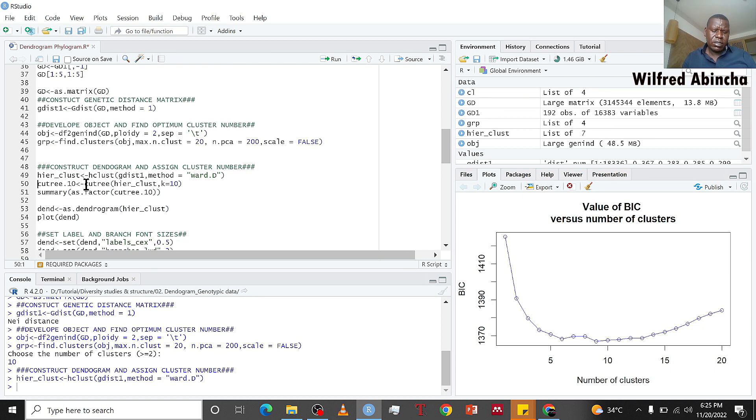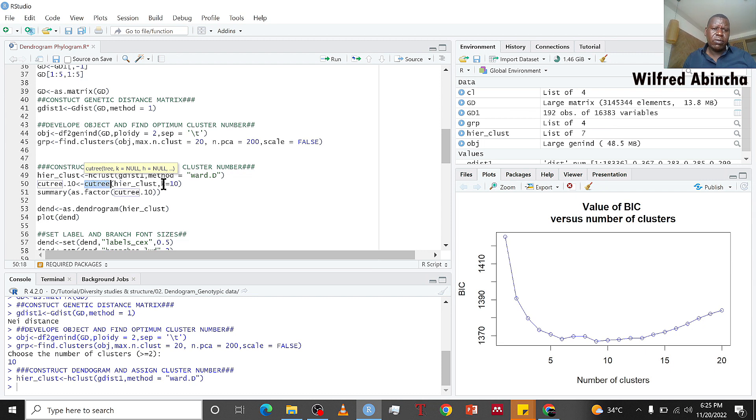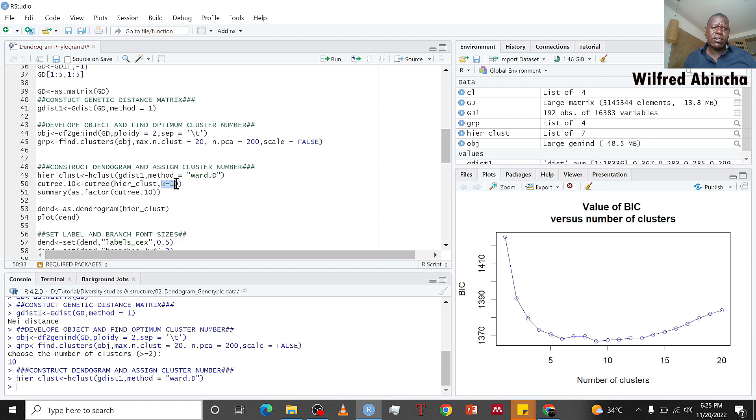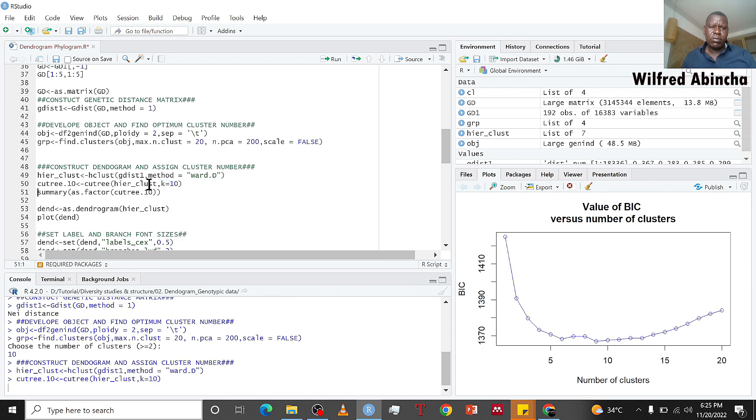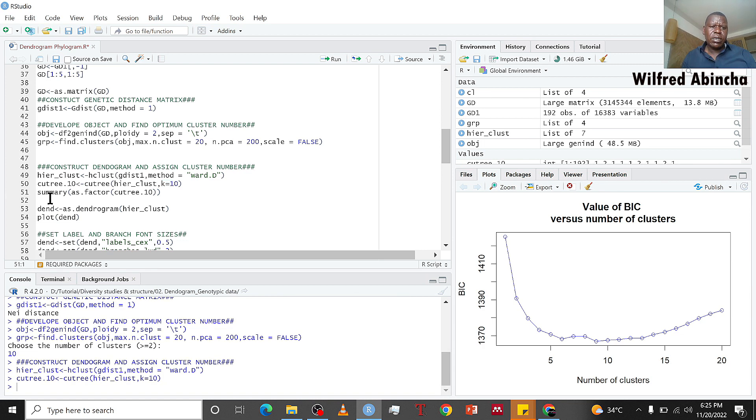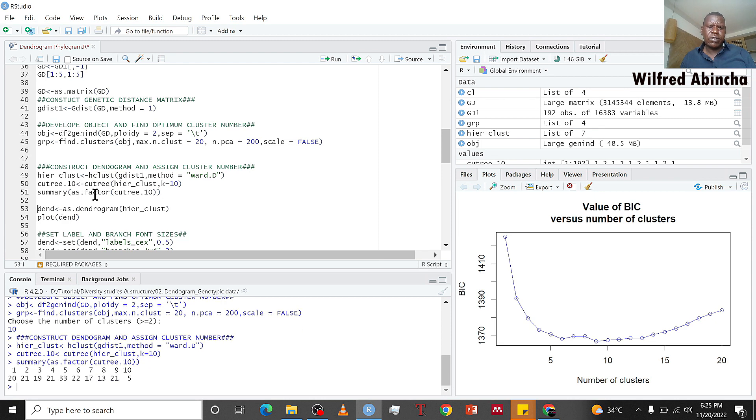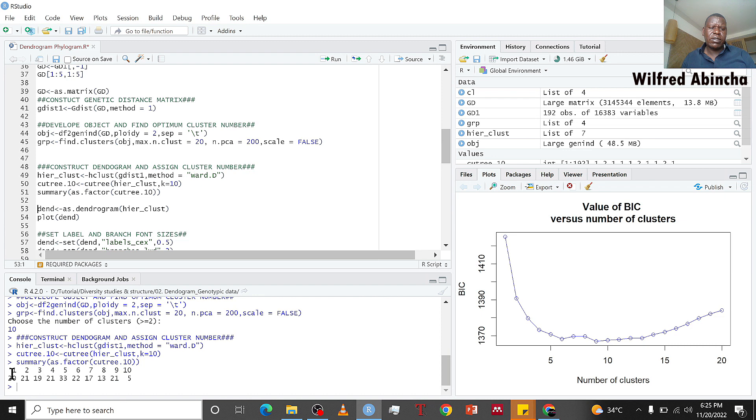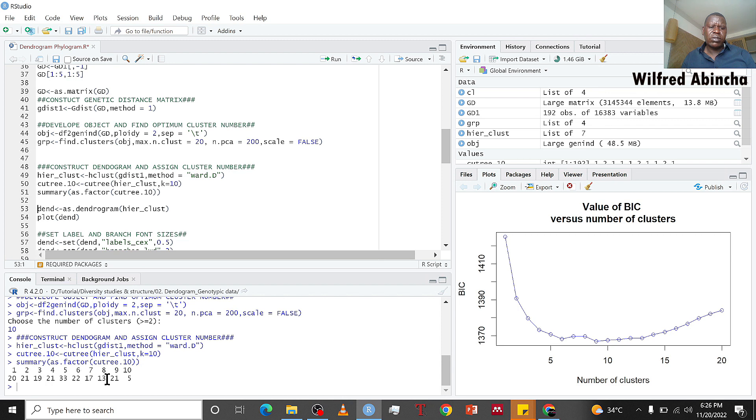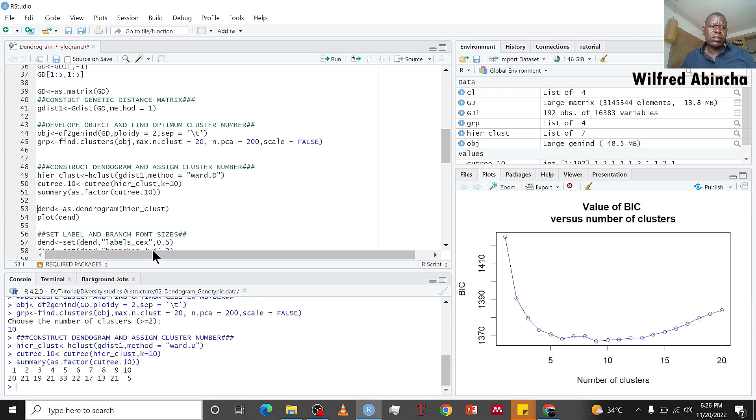By running this we have constructed hierarchical clusters. But now we found that 10 clusters are the optimum clusters that can explain our data. So we use cutree to construct 10 clusters. This cutree is going to work on hclust which we made, and we want only 10 clusters. We get a summary showing the first cluster has 20 individuals, the second 21, and so on until we get 10 clusters.